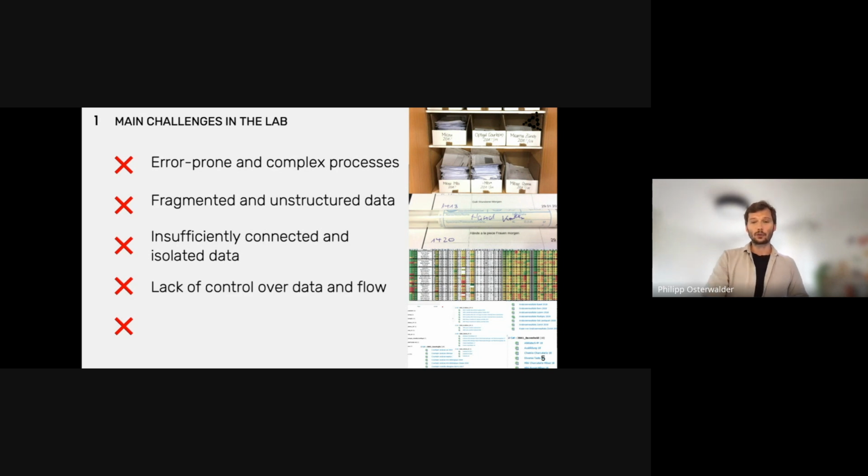The next point is the lack of control over the data itself. Where is the data coming from? Are there any changes to the data? What's the change control? What kind of devices were used to get to a result? Metadata is a big topic here. And also the data flow: where it comes from, where it should go, in which format. This is also a big problem in a lot of labs. And also the traceability, for sure: the compliance, and tracking back the different data and also the results of the workflow itself.